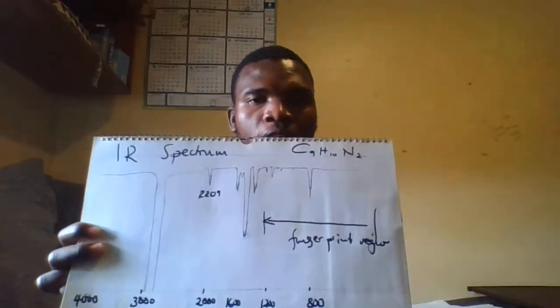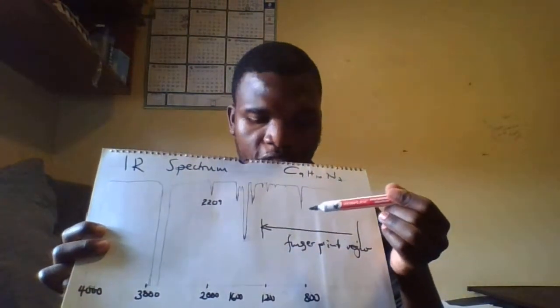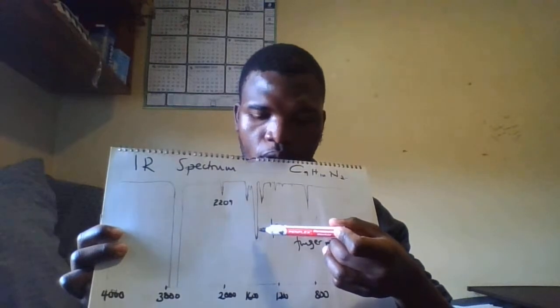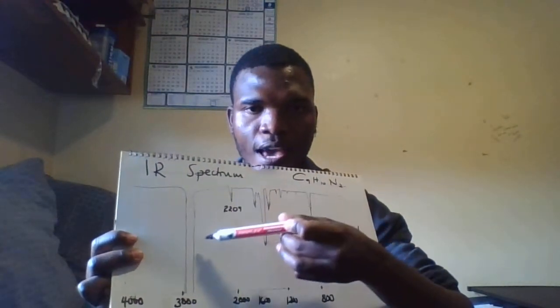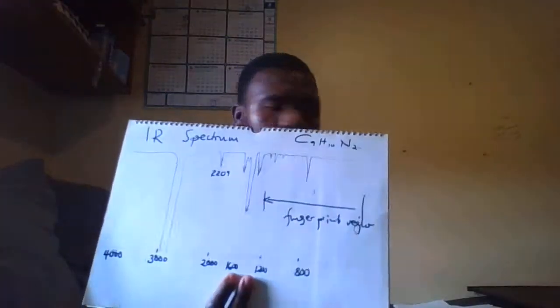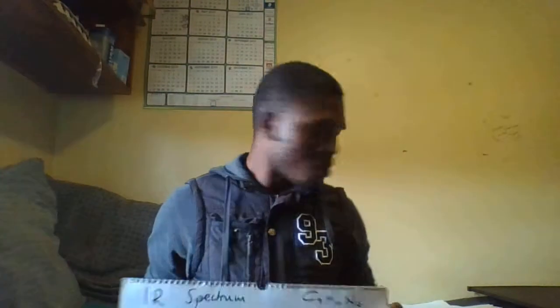to 1.5. But also, as you can see in our diagram, we have some peaks that are sharp, like this peak, for example. I think we can take it into consideration. And also this peak, yeah, we have to take it into consideration, and this one and that one. So the infrared information helps us to figure out the functional groups that we are dealing with in our compound. So let's see how we go about interpreting this information.